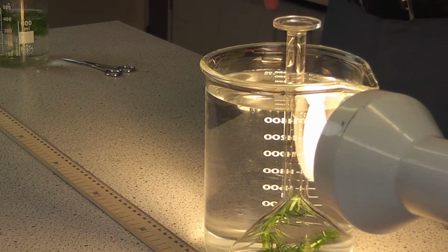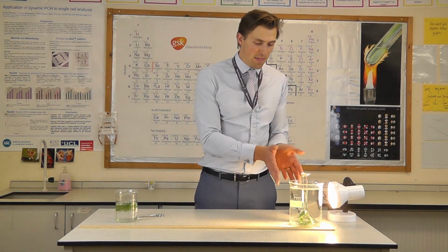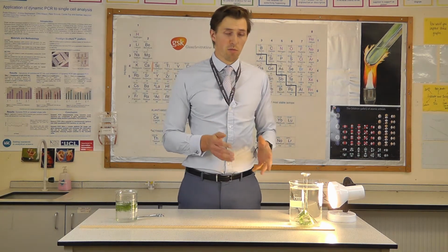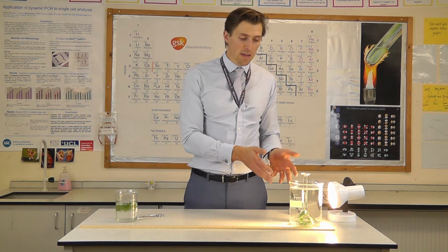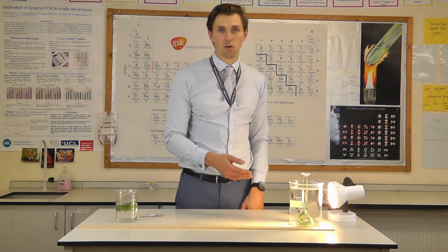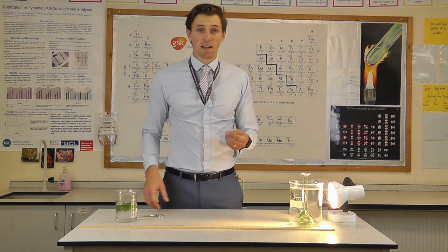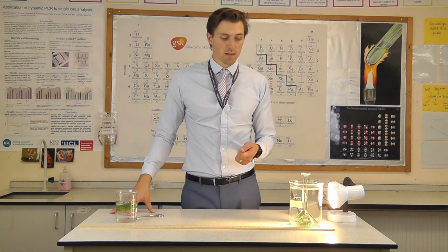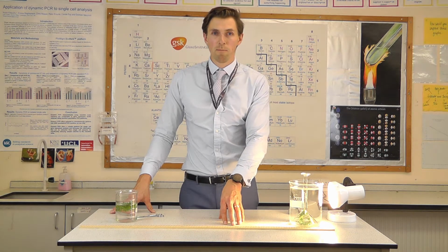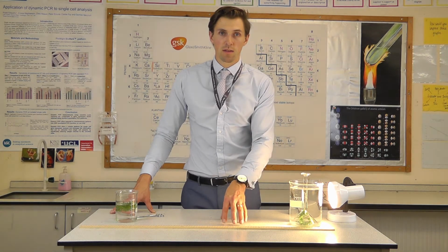Again, I'm going to leave this for a while, at least 5 minutes, possibly longer, to get it acclimatised, and then I would start doing my recordings just as before, so I could use a 5-minute time interval. Again, this depends on the concentration of your sodium hydrogen carbonate. The more concentrated that solution is, the greater the production of oxygen is going to be, because that is a factor that's going to affect the rate of photosynthesis. I'll then pick our distance increments again, and record 3 results for each distance.